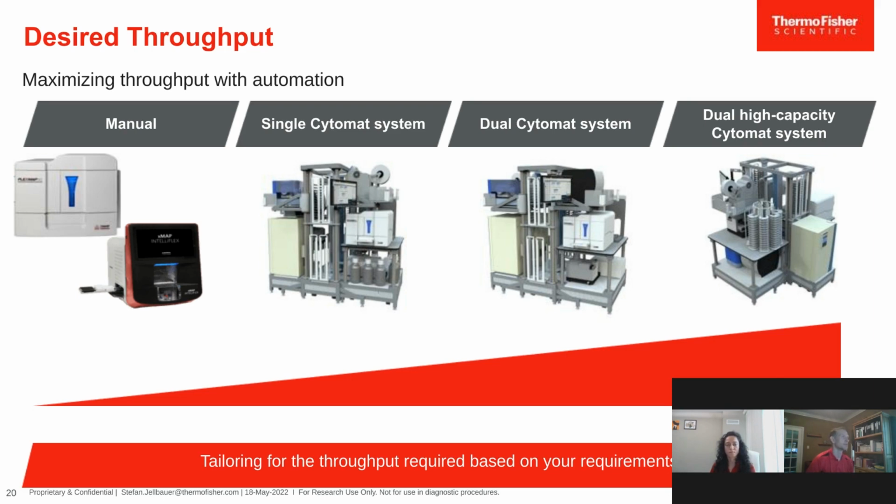Here we're looking from manual all the way to very high throughput capacity systems from left to right. You're going to decrease your time to result, and obviously the data that you can measure increases with higher throughput capacities.